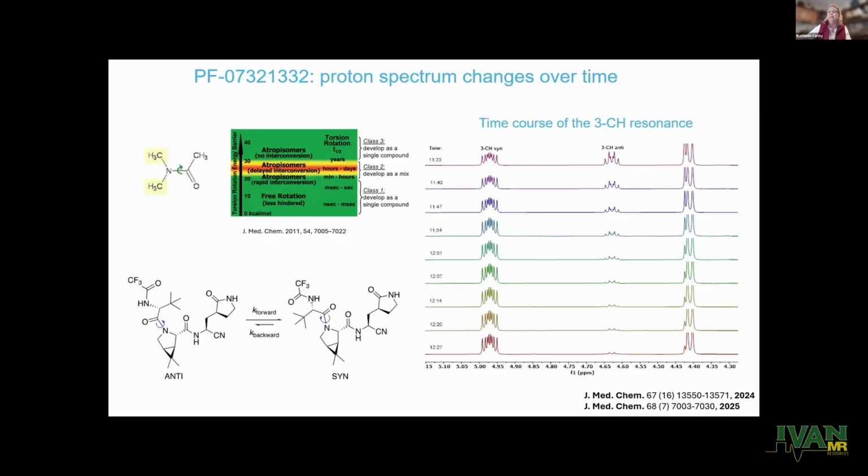So that's something the team wanted to know pretty early on, and they gave me the feedback, Kathleen, can you tell us what's going on here? We really want to stay in either class 1 or class 3 and stay away from these class 2 molecules.